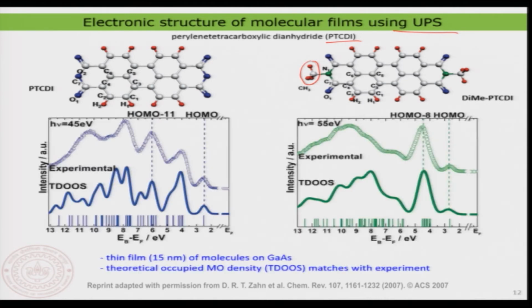We want to do ultraviolet photoelectron spectroscopy of the molecular film, but here what I am doing is just a big film. That is also something you have to see. Now our perspective has also changed. When you look at scanning tunneling spectroscopy or microscopy, you are always trying to look at things in greater detail. You are trying to look at what happens to the molecule when it adsorbs, what is the electronic structure of a single molecule, and so on. Those are the kind of questions you put forward with scanning tunneling spectroscopy or microscopy, because it has that possibility.